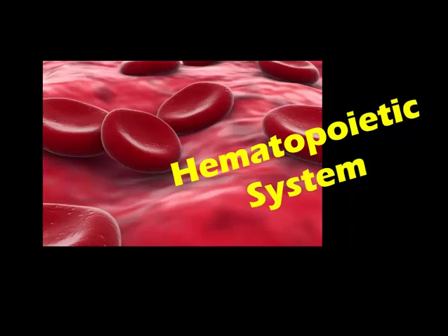Hematopoiesis in mice is usually present in long bones throughout life, and is usually present in the spleen and often in other organs, such as the liver and the adrenal gland. When we talk about the thymus, in mice it does not involute, and Hassall's corpuscles, as opposed to most of our domestic species, are indistinct.